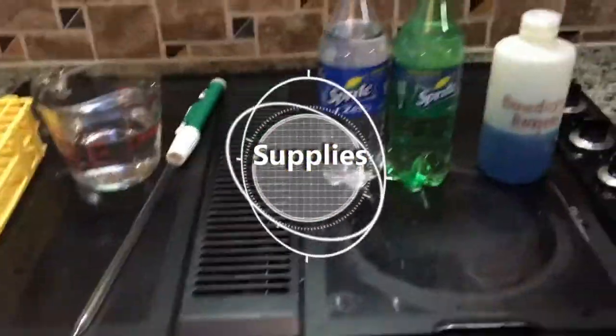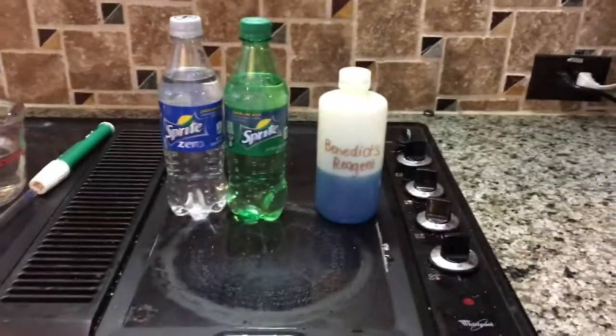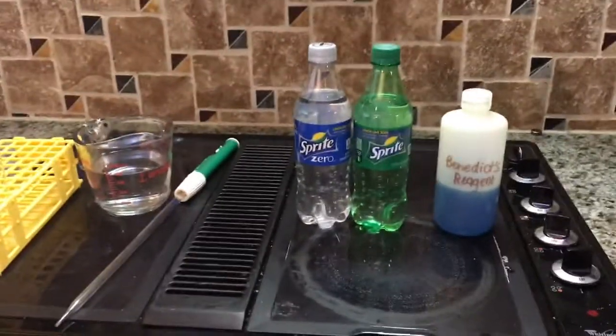In this experiment, we will be using Benedict's reagent to see if there's a presence of sugar in Sprite Zero. These are the supplies that we will be using, and then the Sprite Zero and the Sprite are the reactants, and the Benedict's reagent is the indicator.